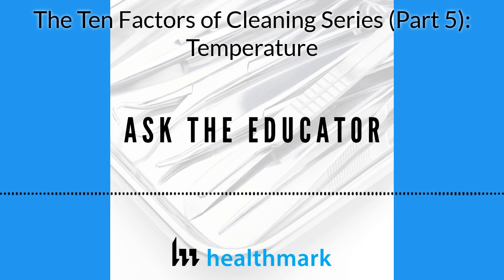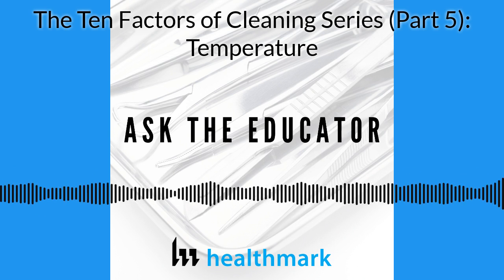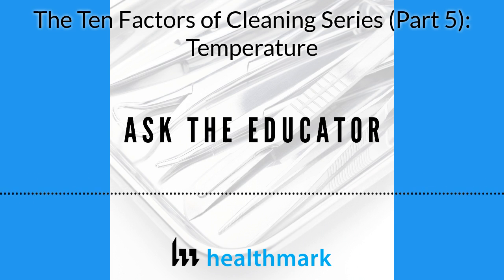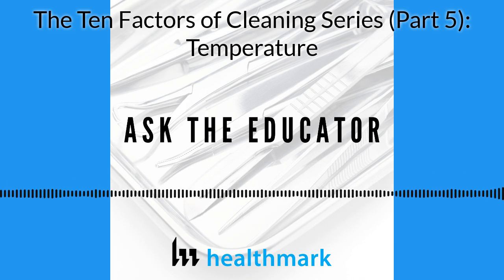So you start your process with the cold water by rinsing, then you go maybe higher depending on what your detergent is, and then you rinse again, and then off to the machines. And I think maybe something else to talk about is how to monitor those temperatures in the automated washers, right?